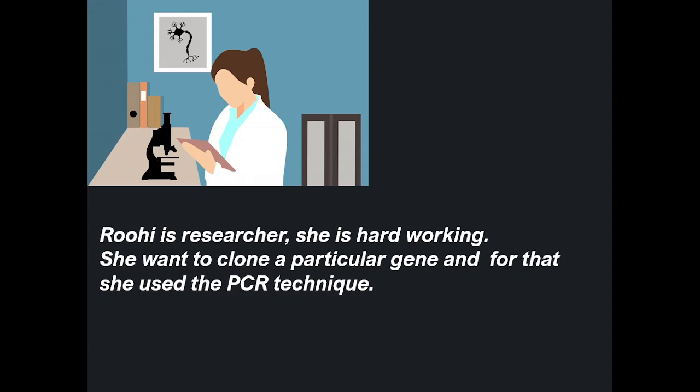Today I am going to tell you a story of Ruhi, a new researcher in a molecular biology lab. Ruhi is a dynamic, meticulous planner and a very sincere student. She wants to clone a gene, and as a first step, she isolated the genomic DNA.